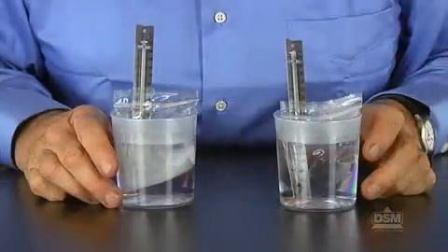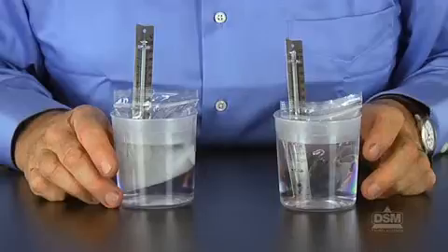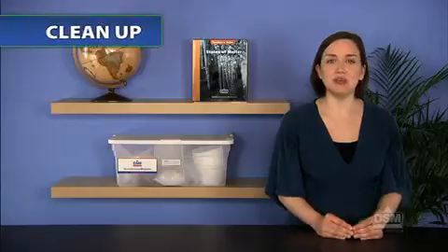Finally, review with the class that the melting point of a substance is the temperature at which it changes from a solid to a liquid, and that melting points of different solids are different. To conclude the activity, remove the thermometers and reseal the bags with the butyl stearate. Pour out the water and ice from all containers and bags. When all materials are dry, return them to the kit.